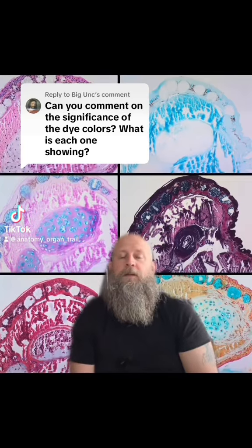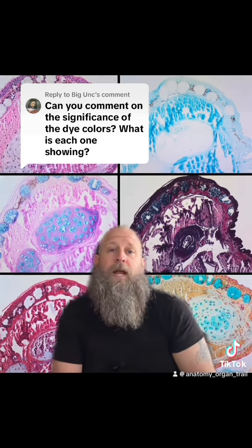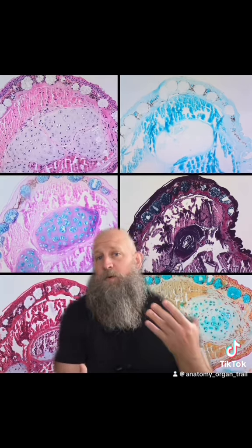Can I explain what the different colors mean? Yeah, I can. But we have to understand that as histologists, we can make a tissue really any color that we want. This is the beauty of the blend between biology and chemistry. So we can make specific stains or dyes to highlight whatever it is that we want.